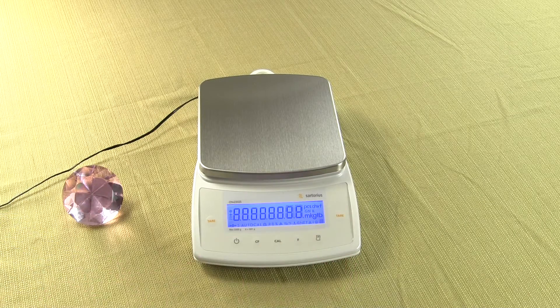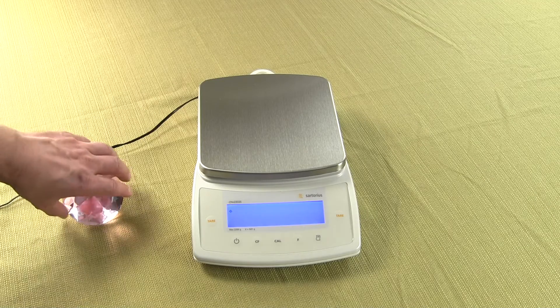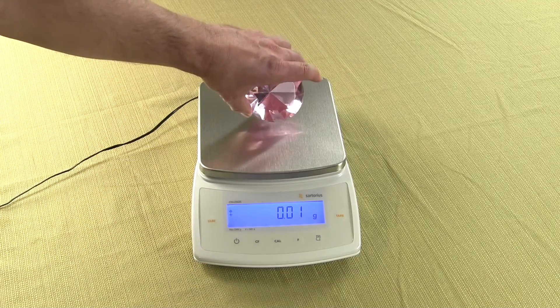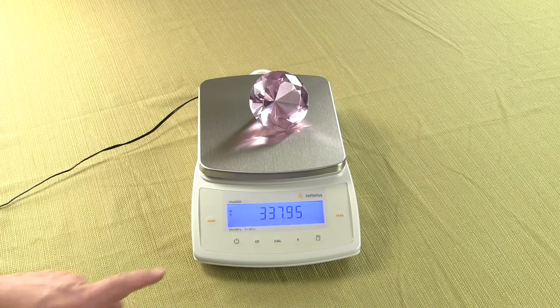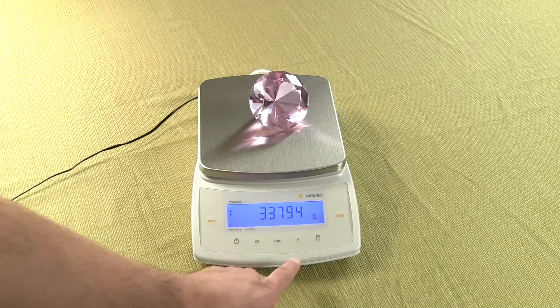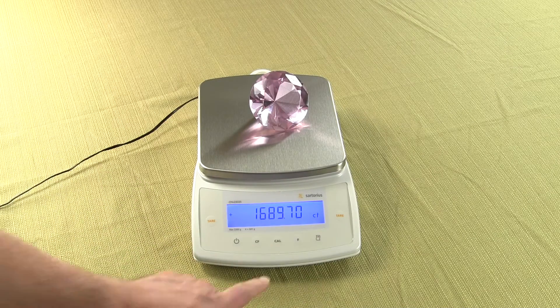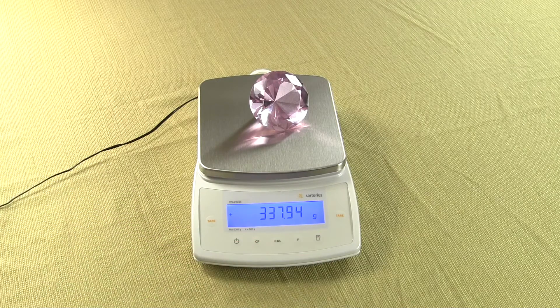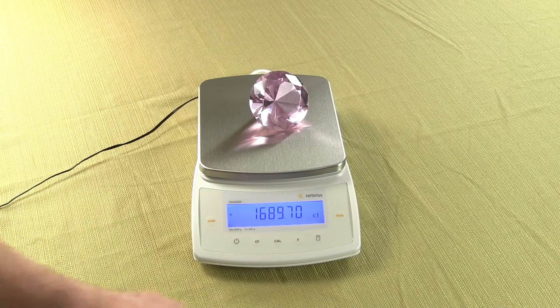Press and hold the tare key. The balance resets and goes to 0.0. Put our item on the balance, and now press the F key. We are in grams right now. Press the F key — we are now in carats. Press the F key again — we are now in grams. Press the F key again — we are now in carats.